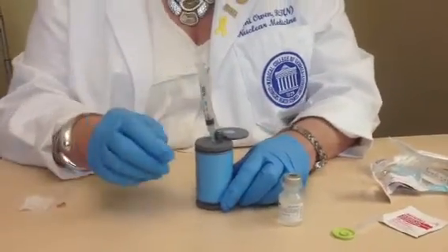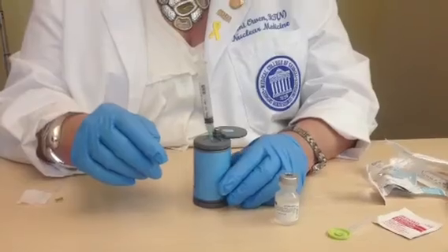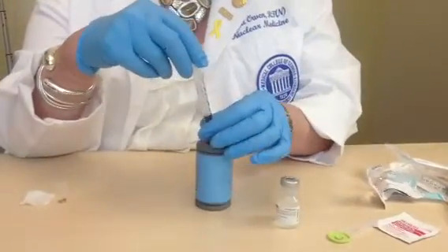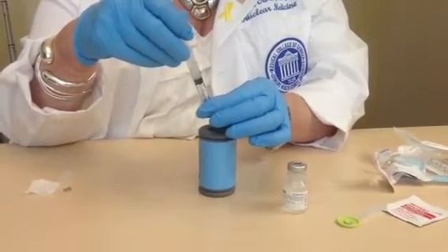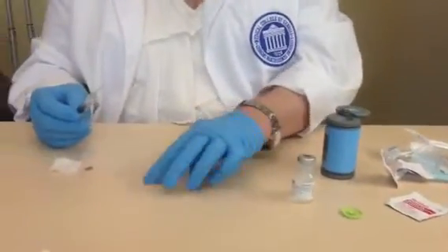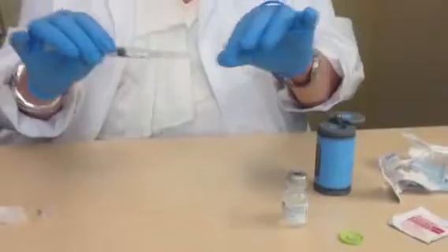Now, one thing I want to do, because it's a negative pressure vial, and when I get ready to withdraw my radioactive dose from the vial, I want to make sure that no air has been introduced to it. I injected 2 mLs in volume, so what I'm going to do is draw back 2 mLs in air to make sure that the vial is pressurized in the way it should be. There we go. And then in this particular case, I'm going to do a one-handed recap of the syringe like this. I'm just sort of going to chase it like that, turn it up, and push it down. Never will I recap like that.